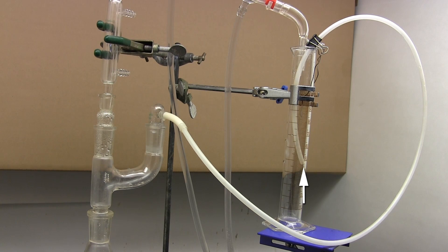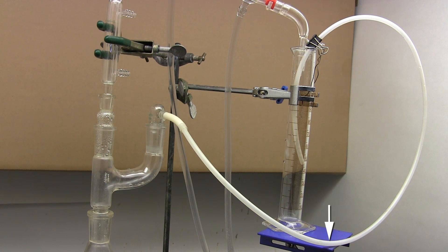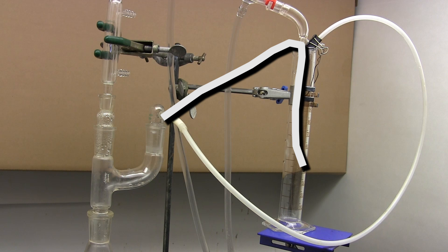First, make sure the inlet of the siphon tube is below the outlet relative to gravity. Second, the lowest point in between the two ports must be lower than the bottom of the graduated cylinder. So going by the shortest distance is not allowed.